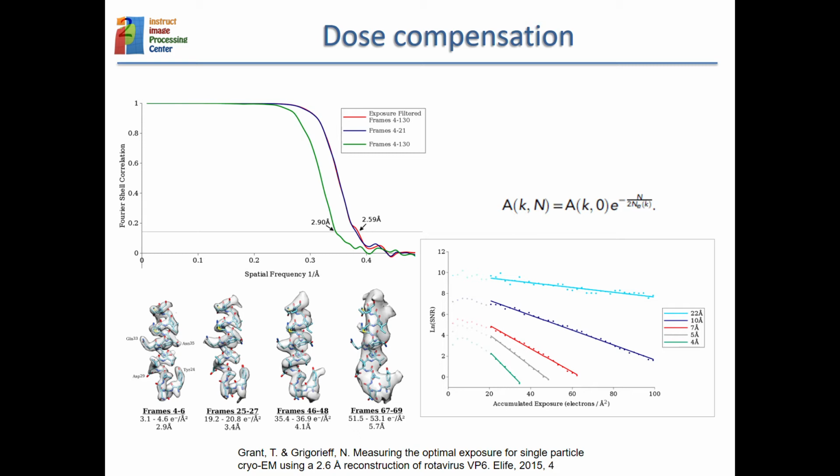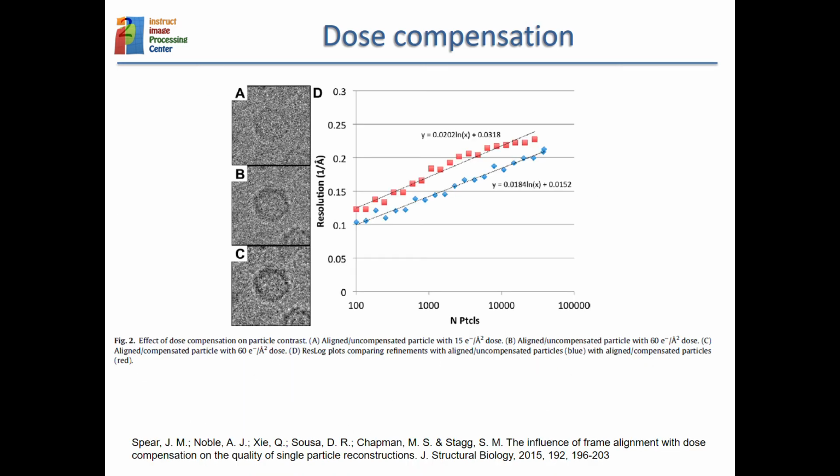So sometimes they work and they help to get better resolution, and sometimes they don't work, meaning that they don't help, or they even do some harm. And I would say that now maybe the trend is to look for these weights at the end of the processing, through the polishing.